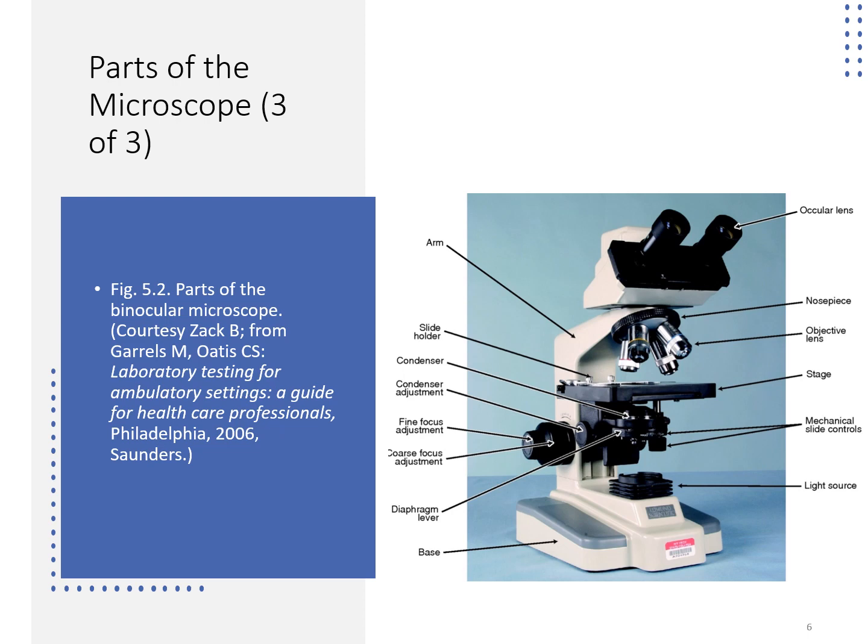When I'm going over, or your lab instructor is going over, the various parts of the microscope, or the various things you need to do to care for that microscope and set it up for your eyes, we will refer to these various parts. So make sure that you are aware of what they are.